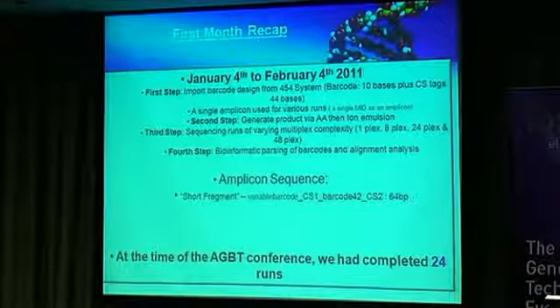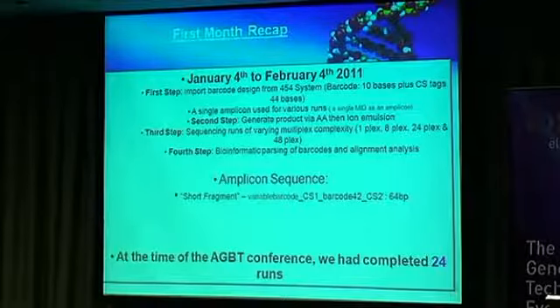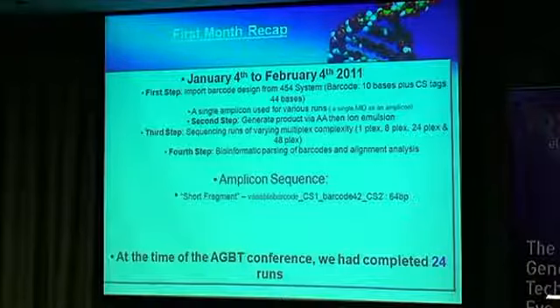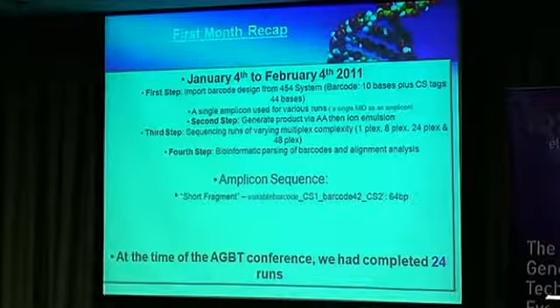So we took the barcode sets that we had at 454, and using a platform from Fluidigm, we wanted to challenge the system just to be able to differentiate the barcodes. So we ran, as I did here in the first month, a 1-plex. Could you tell me the barcode I ran? 8-plex, 24, and 48. And each time we would send the data to our bioinformatics folks, and then they would tell us which barcodes they detected. And that's all we wanted to go after in the first month. Very simple, but very important at the same time. So this was what we wanted to do in the first month leading up to AGBT.